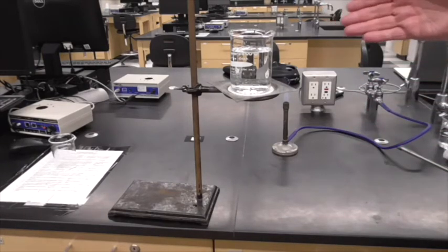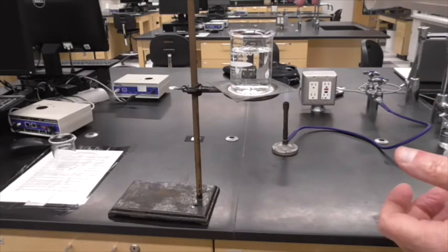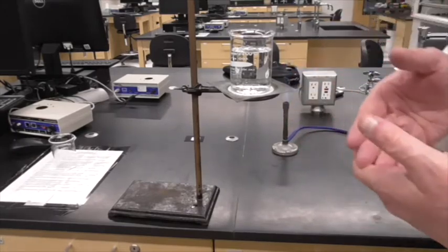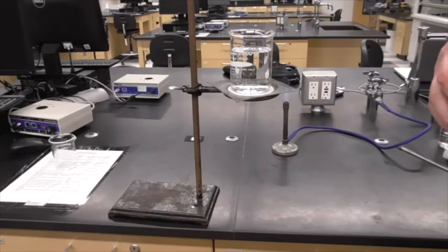And then we're going to get our sample that's over in the hood, melted at about 90 degrees, and we're going to put them together. Then we're going to take readings every 30 seconds of the temperature and what the sample looks like, so that we can get a nice curve for our freezing point.